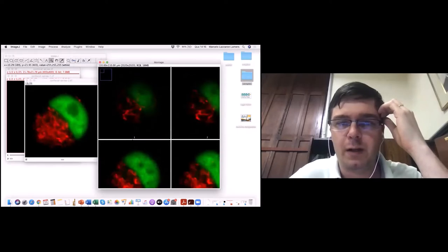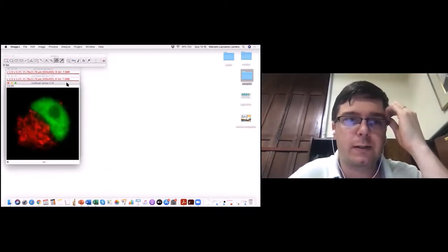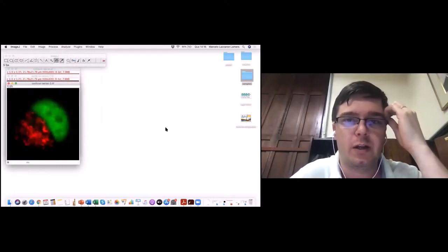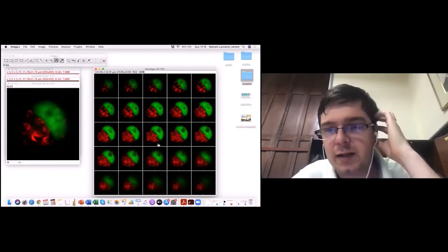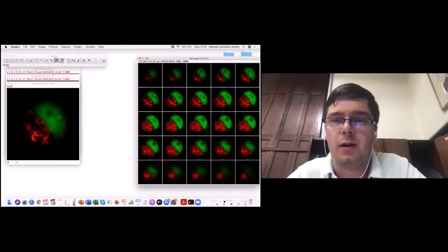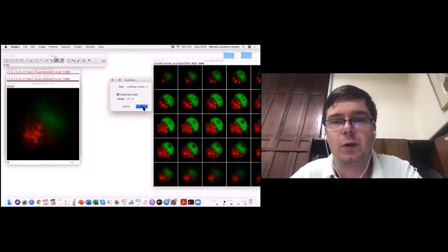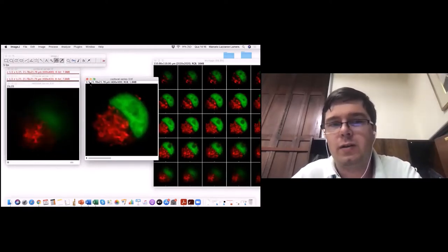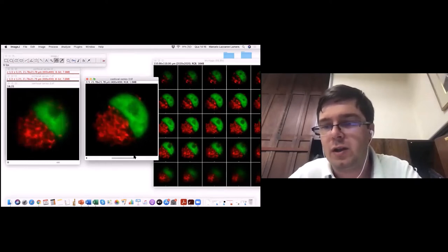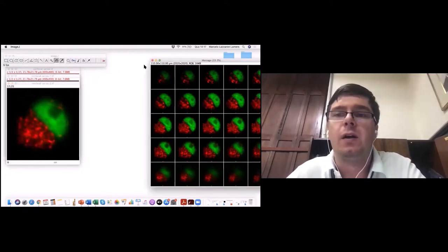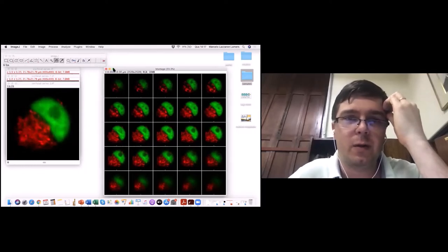Essa é a primeira dica para quem trabalha com fluorescência no eixo Z: ter um panorama geral do que está acontecendo. Com o label, é possível ver a qual foto corresponde cada imagem. Por exemplo, posso duplicar apenas as fotos 11 a 13, informando esse intervalo na duplicação. Duplicou — o stack tem de 1 a 3. Assim fizemos a separação usando o ImageJ. É possível fazer split channel em relação a isso. Essas ferramentas de stack serão conversadas mais com vocês amanhã.